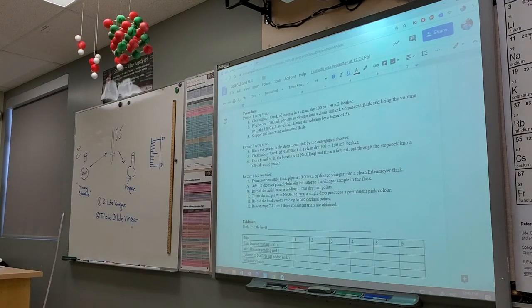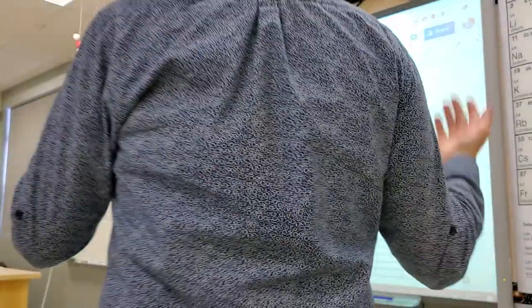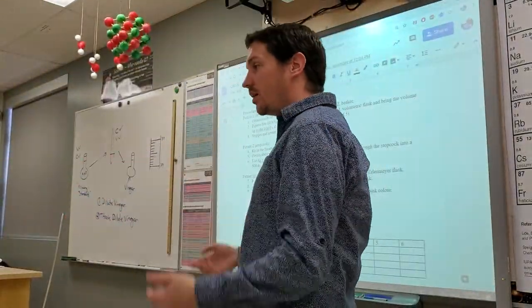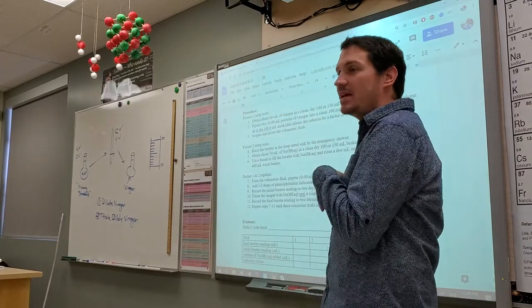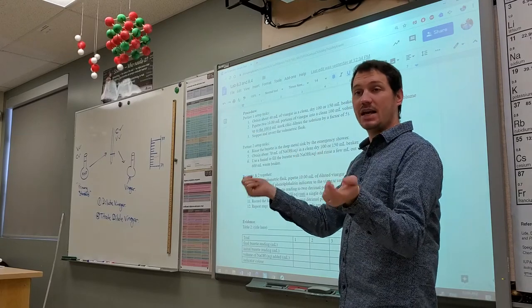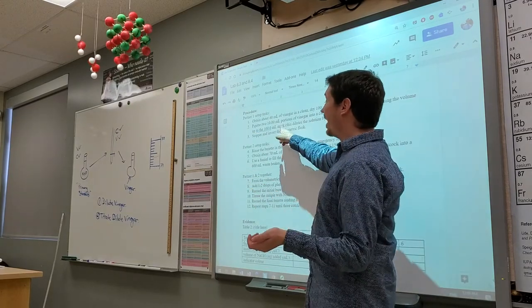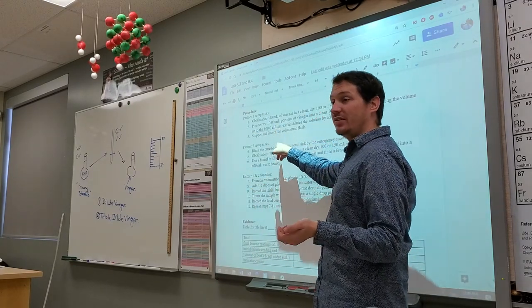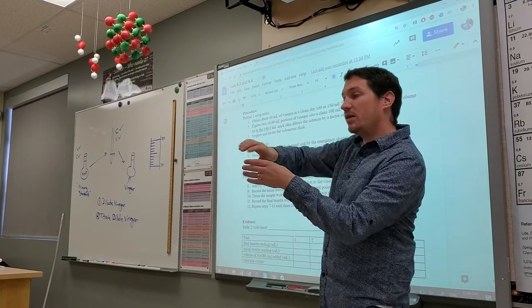Do you feel like you're ready and capable to take on this part of the lab? It's basically the exact same thing as yesterday except one person's preparing the burette the exact same way we did yesterday and one person is diluting the vinegar.